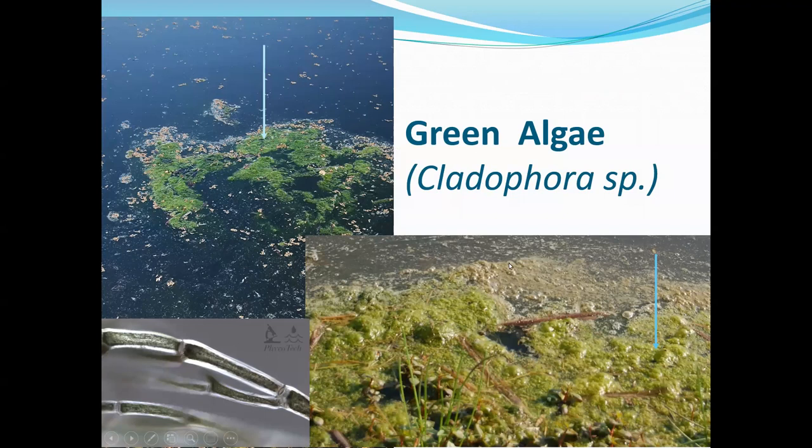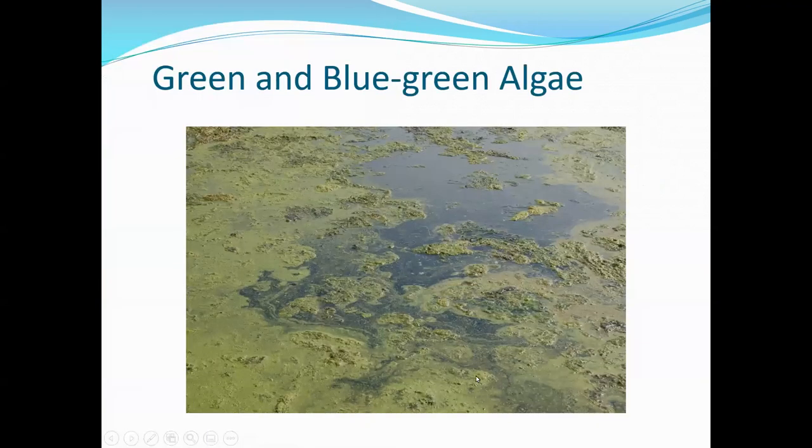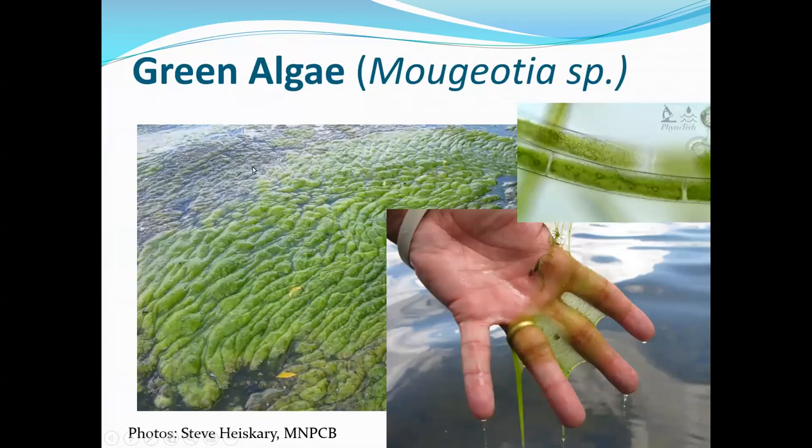That is actually Dolichospermum. So here's a picture of this material. And, you know, cell walls, nice thick cell walls, I believe this is Cladophora fracta, and is branched. So clearly Cladophora, and it's up out of the water by a fair bit. And this is where they're mixed. So the stuff that's right on the surface of the water is the Dolichospermum, and this puff paint stuff that's well out of the water is the Cladophora. So they can be mixed.